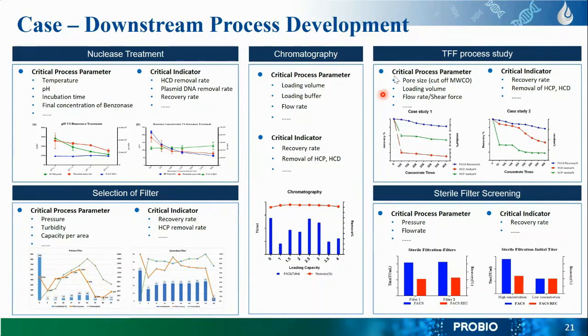When it comes to different chromatographies, they have gained more importance in manufacturing. For example, IEC, ion exchange chromatography, is one of the most widely used techniques for the purification of large particles, which exploits the differences in their particular charges as well.